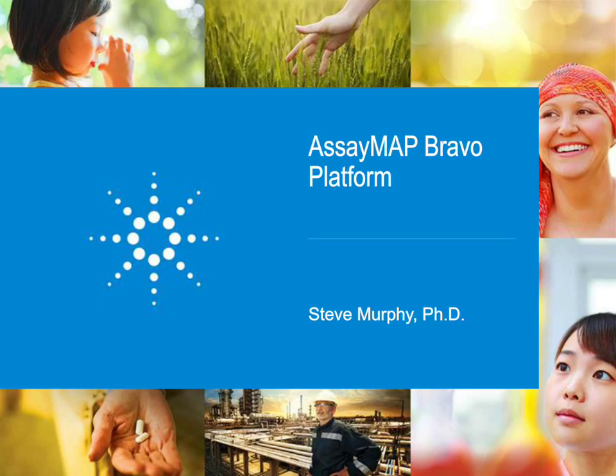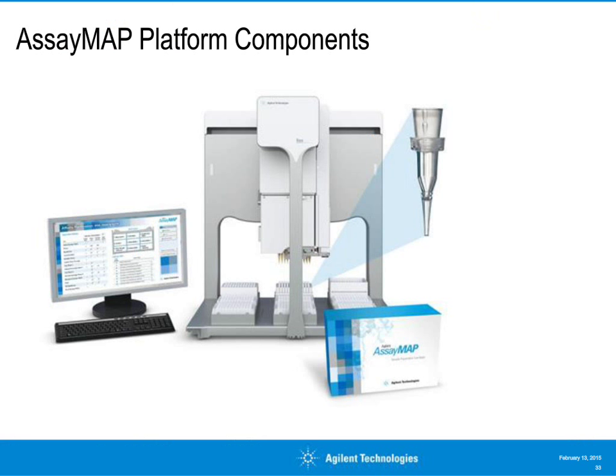Tasso just provided a very nice example of the kind of results that can be achieved using AssayMap Bravo. I'd like to take a step back and give a little more detailed overview of the AssayMap platform and how it can help you automate your sample prep workflows. On this slide, you can see the platform is composed of three basic elements. The first is the Bravo liquid handler with an AssayMap head containing 96 probe syringes. The second is the AssayMap cartridge, which mates to the probe syringes. And the third is the simple user interface that controls the AssayMap Bravo. In the next few slides, I will go into more detail about each of these components.